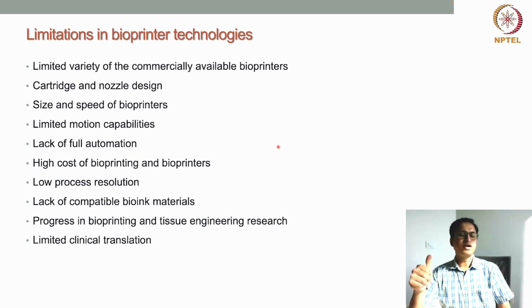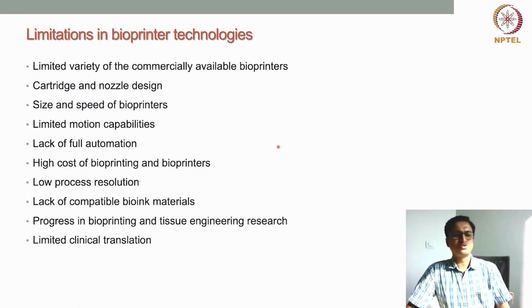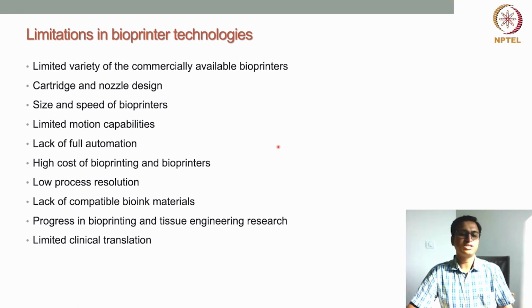Another thing is that most bioprinting technologies and bioprinters are very expensive. So the high cost of bioprinters is a deterrent for widespread usage or availability of these bioprinters. The cost of bioprinting technologies should be brought down.